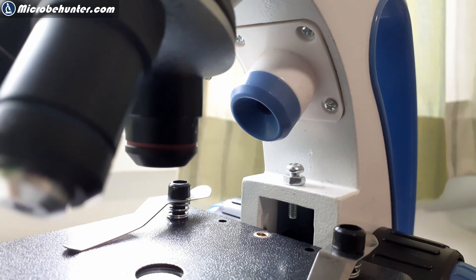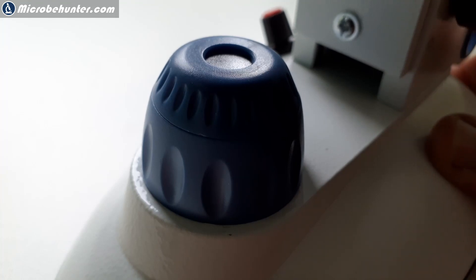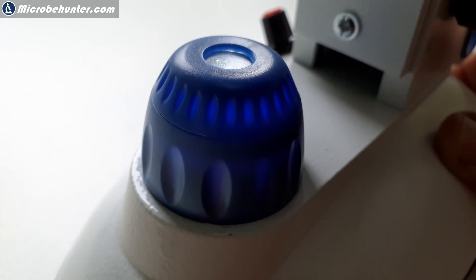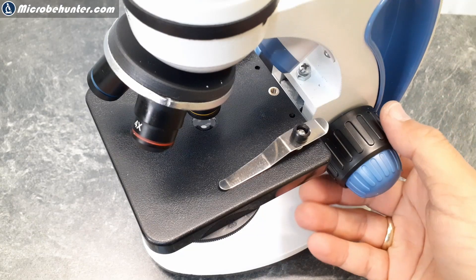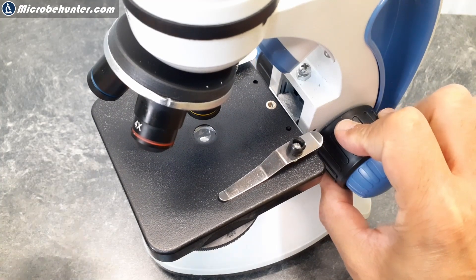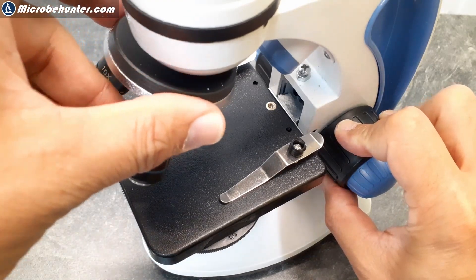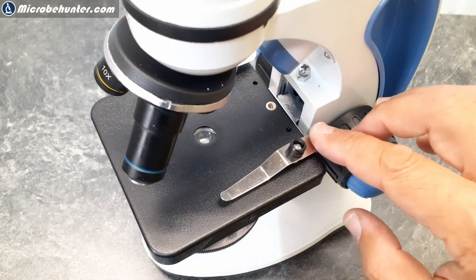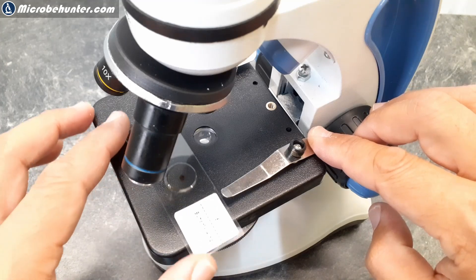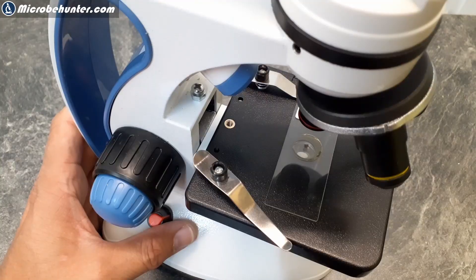We can see that there are two lamps. There's an epilumination from the top and there is also the main microscope light coming from the bottom. So you can watch both transparent specimen and also opaque specimens. And both of them can be operated from a switch on the back. It has a coarse and fine focus knob. So that's quite nice. And it has a 4x, 10x and also 40x objective.